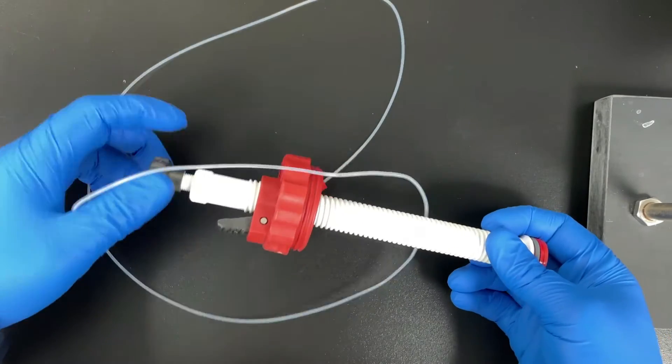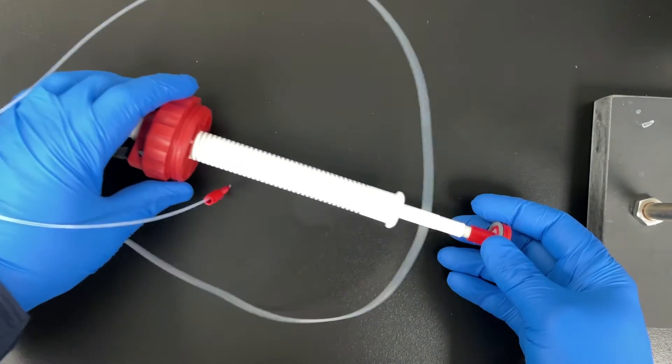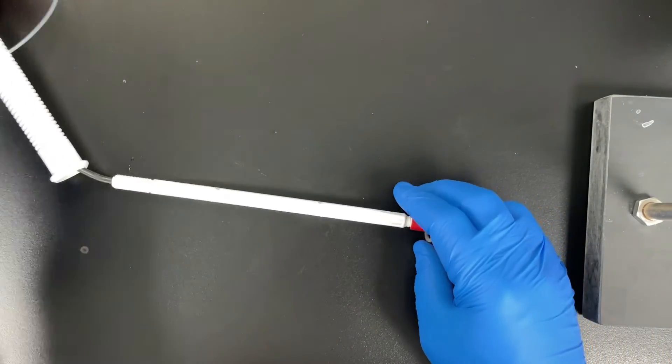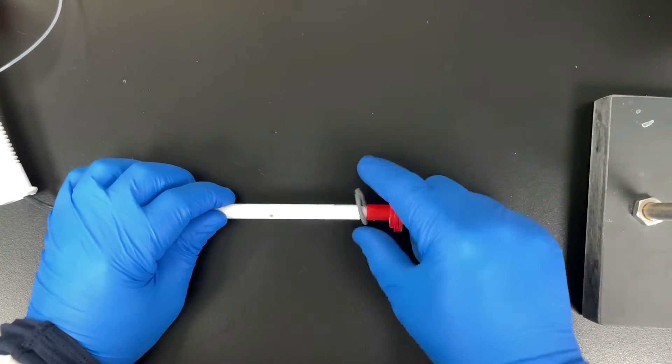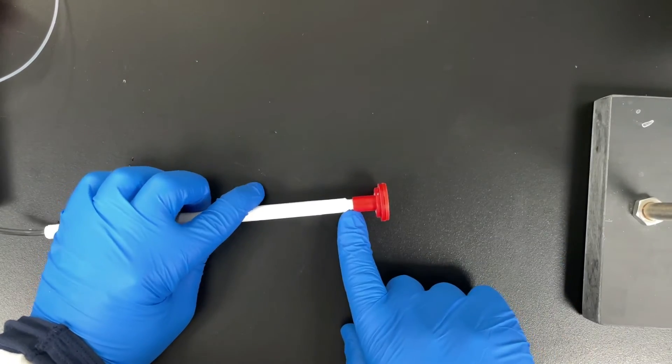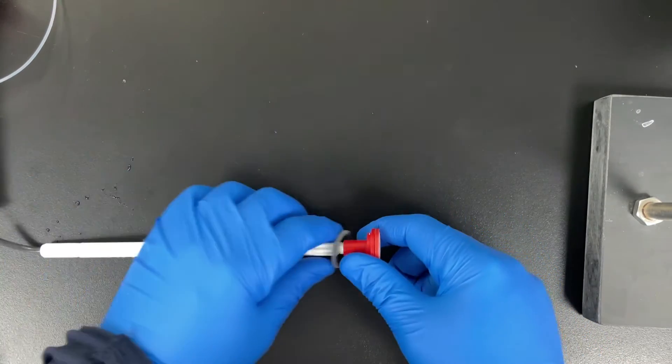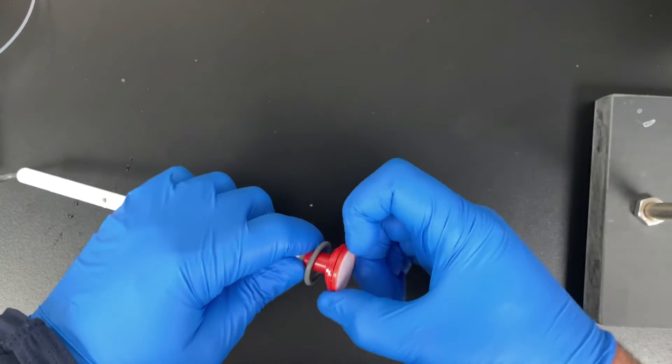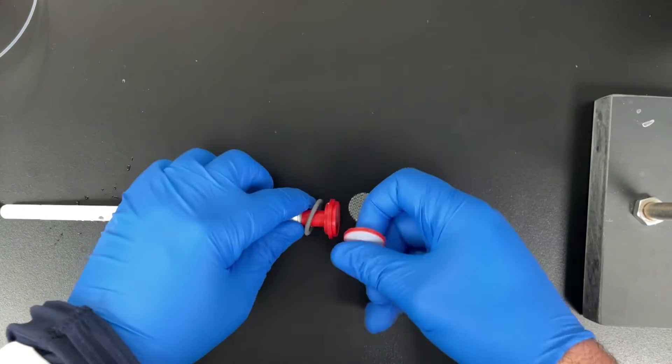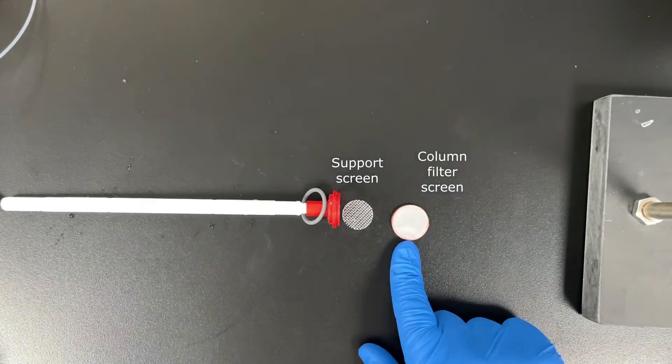We want to pull the central stem out from the middle of the column and then look at this connection here between the red distributor and the central stem. This is a very important connection. If it's not snug, it could cause leaks later. Then we're going to check the filter screen. We're going to pop it off to make sure there's no damage and that we have the support screen as well.